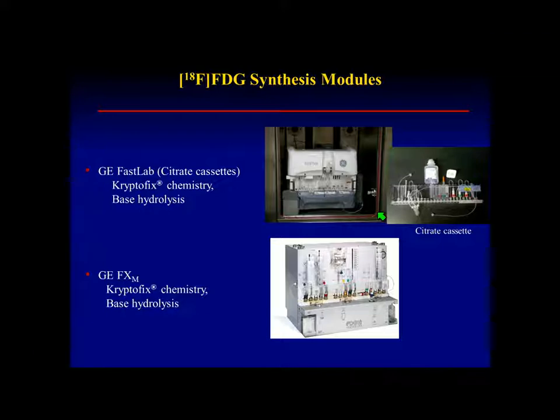When I started in this field, we made up all those reagents individually ourselves. We made them up in an aseptic manner, but they weren't sterile. We didn't test them to assure they were sterile. We assumed that they were, but it wasn't really important because our final product is sterile filtered, and that's the bottom line. But when we are able to purchase these cassettes, it saves us a lot of time, and we have a sterile product to start, which is great.